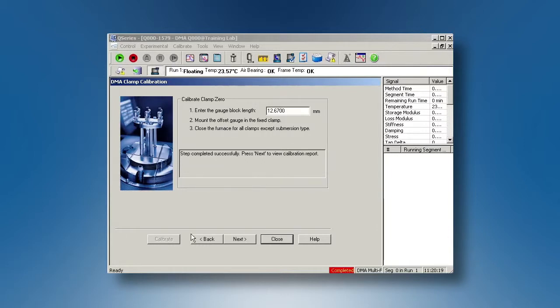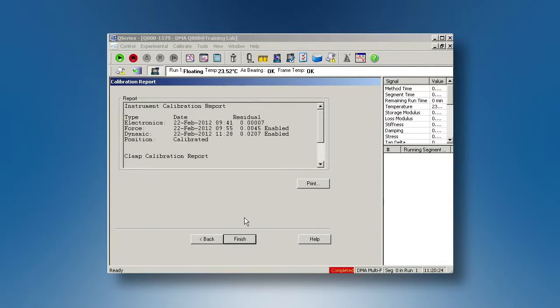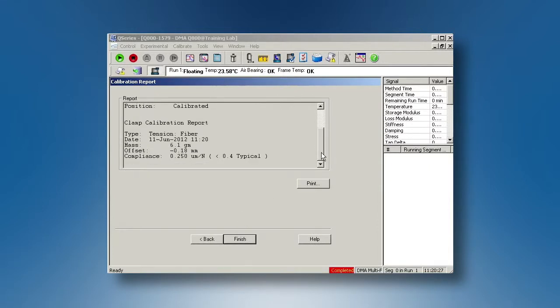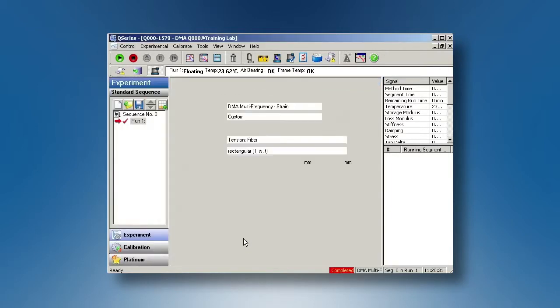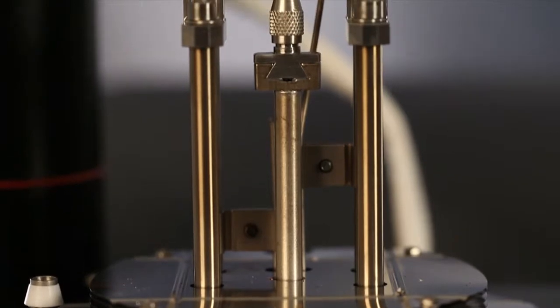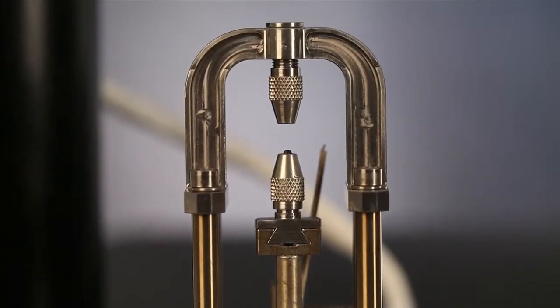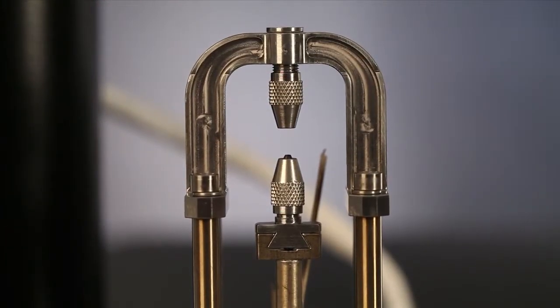After this is done, click on next. View the calibration report. You have now finished the fiber tension clamp calibration. This fiber clamp is good to measure single fiber as well as fibers in bundle.